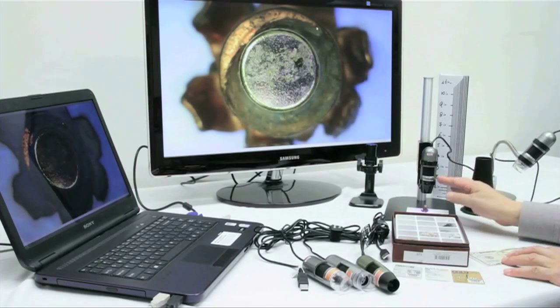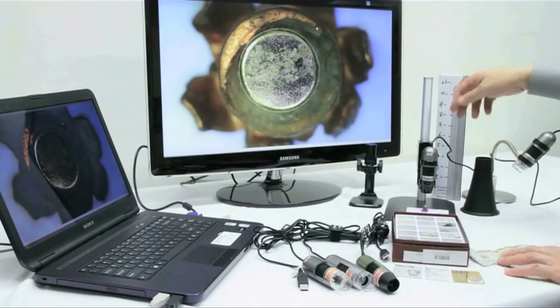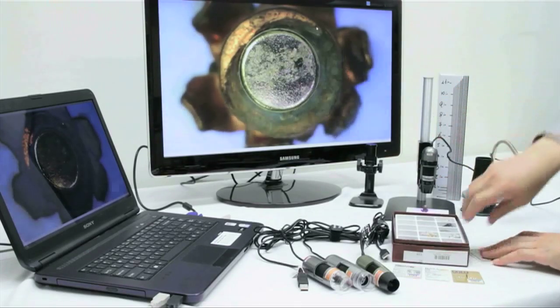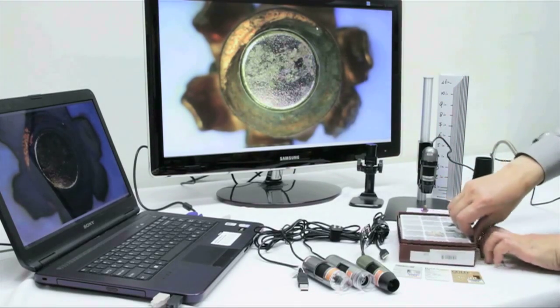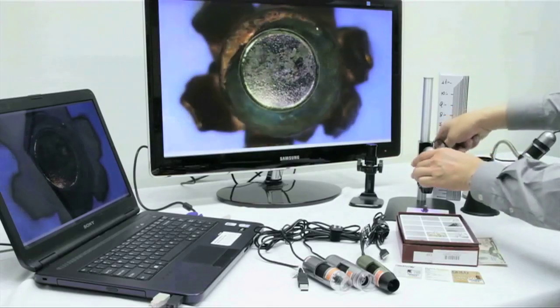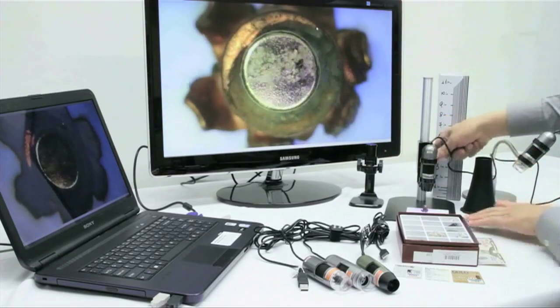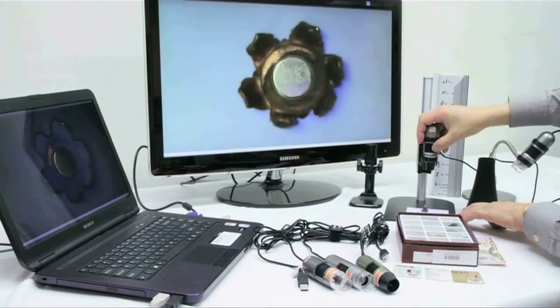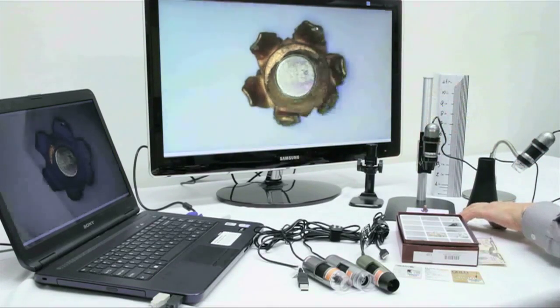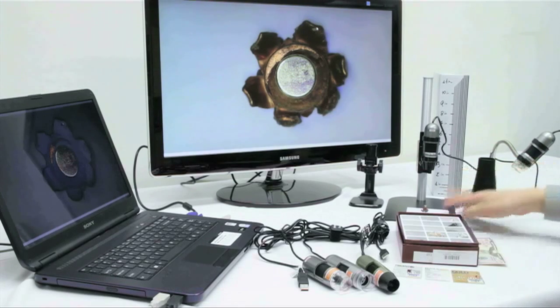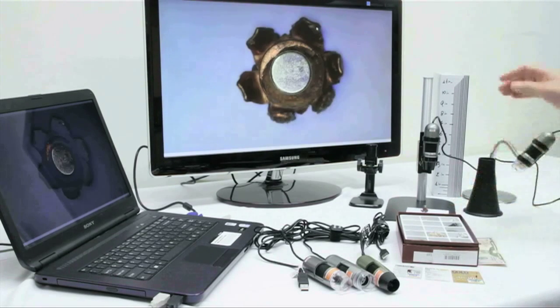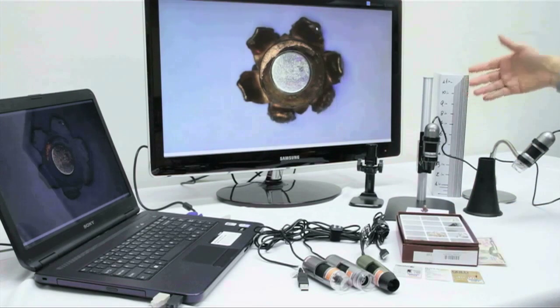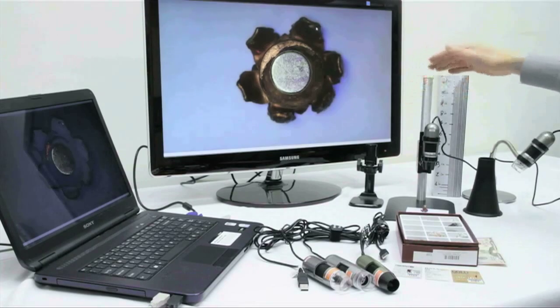On the screen here we have a bullet, and this image is magnified at 25 times magnification. If you wanted to lower the magnification, get a wider field of view, you would just move the microscope up. Here you can see the working distance is around 4 to 5 inches, and we are maintaining a 15x magnification.